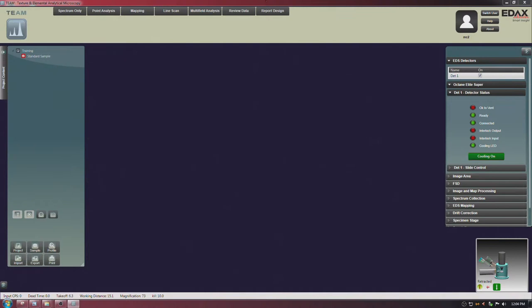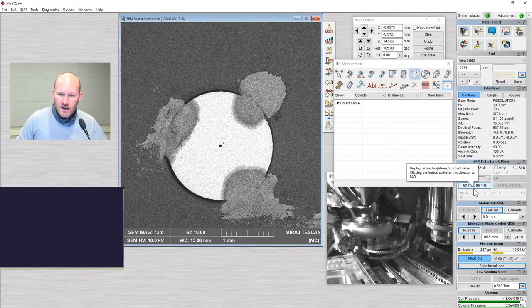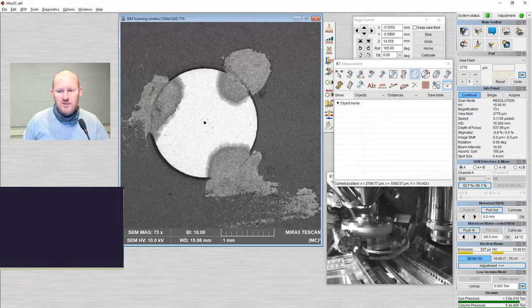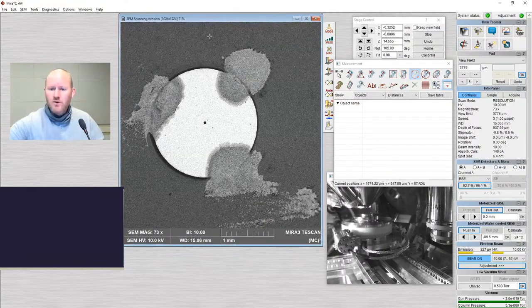I'm going to go back to the platinum aperture. Back in the mirror software on the platinum aperture, if I look in the backscatter image, I can see there are at least three distinct compositions here. Let's go back to EDAX.